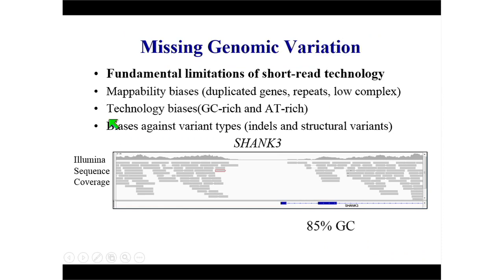So this is the problem. In human genetics, we think we're good at detecting variation, and I would argue that we're pretty good at detecting large variants, so things greater than a few kilobases in size now, and in terms of detecting single nucleotide or point mutations within genomes, for the vast majority of at least the euchromatin. But in fact, we're fairly poor for different classes of variation.